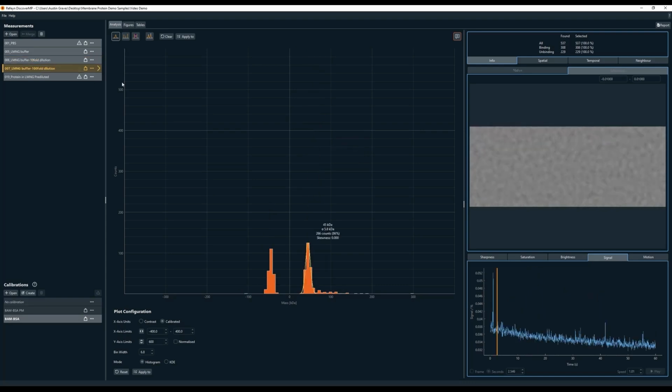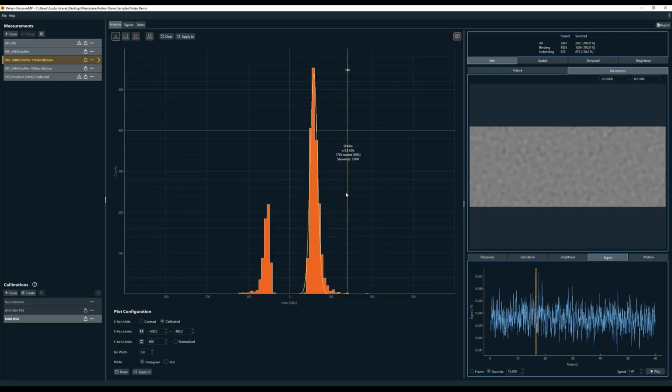So if we go down to 100-fold dilution, we can reduce the background signal even further. The protein we're looking at in this particular experiment happens to be over 100 kilodaltons, so a background peak at 59 kD, like this, would be perfectly acceptable.